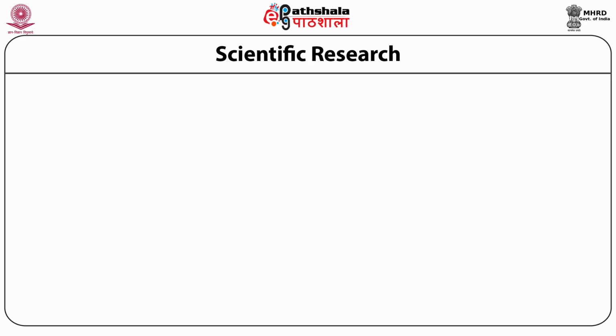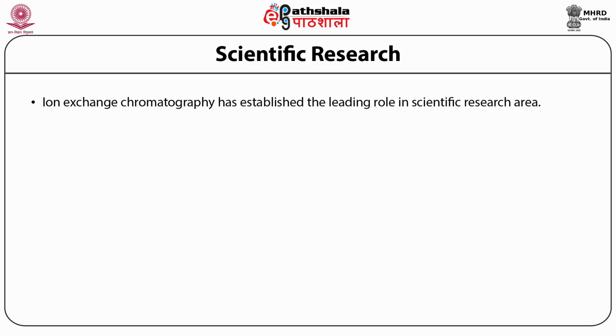Scientific research. Ion exchange chromatography has established a leading role in the scientific research area. For instance, the purified form of immunoglobulin G is efficaciously utilized in the passive immunization process. It proves to be effective in using DEAE Sephadex A50 to yield pure immunoglobulin G.